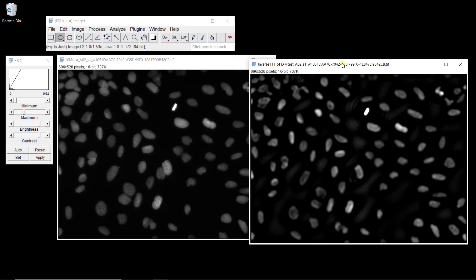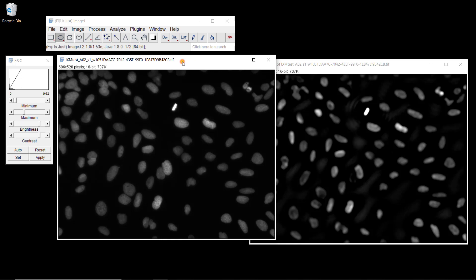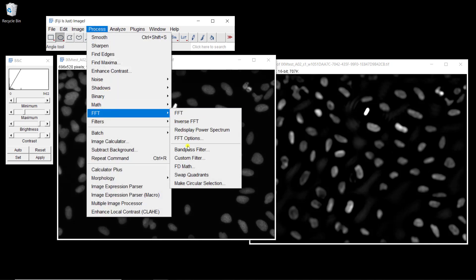When you do that, you get rid of the high frequencies, so we don't have noise. The regions in the nuclei are flatter than in the original image. We also lose sometimes some of the contours — you can definitely see that when you have nuclei that are touching; three nuclei here that are now much fainter. If you want to do something that is probably cleaner, you can use the bandpass filter that is built into ImageJ. Go to Process, FFT, and you actually have a bandpass filter.